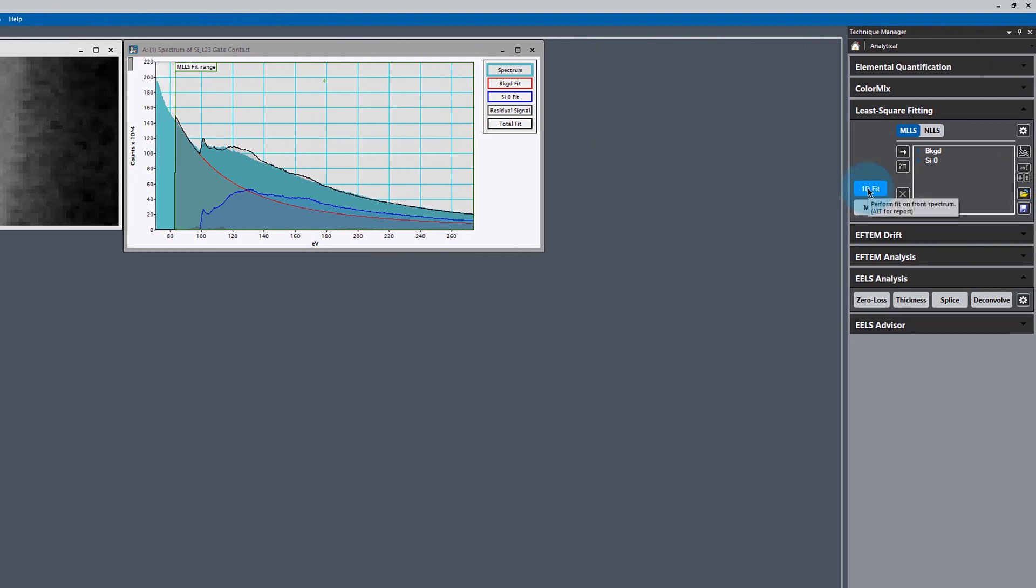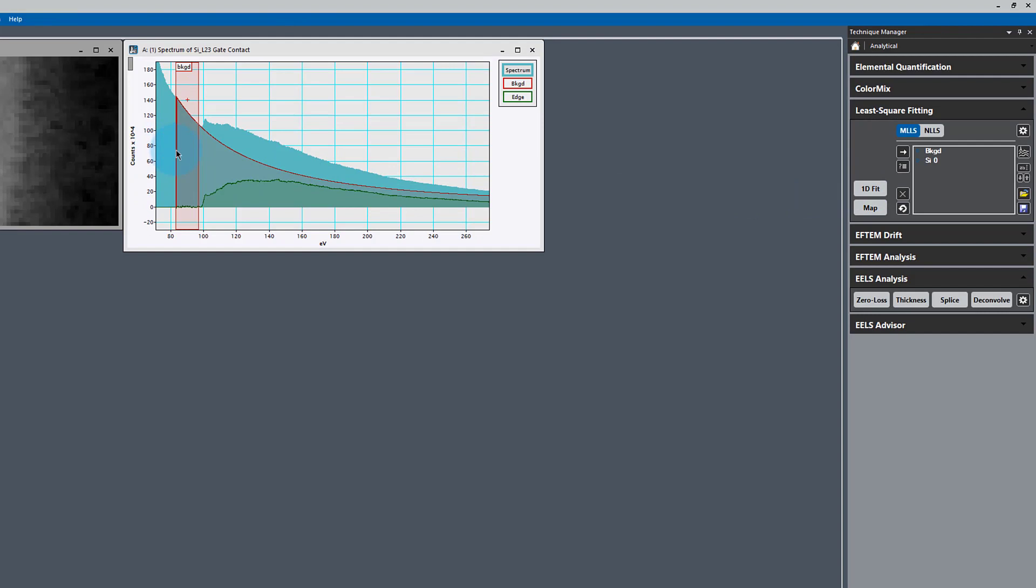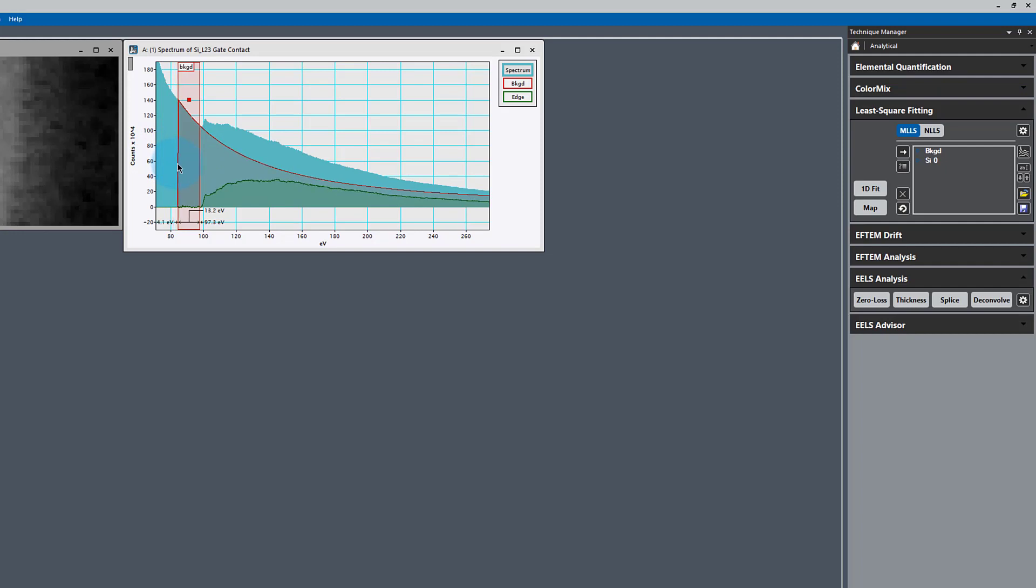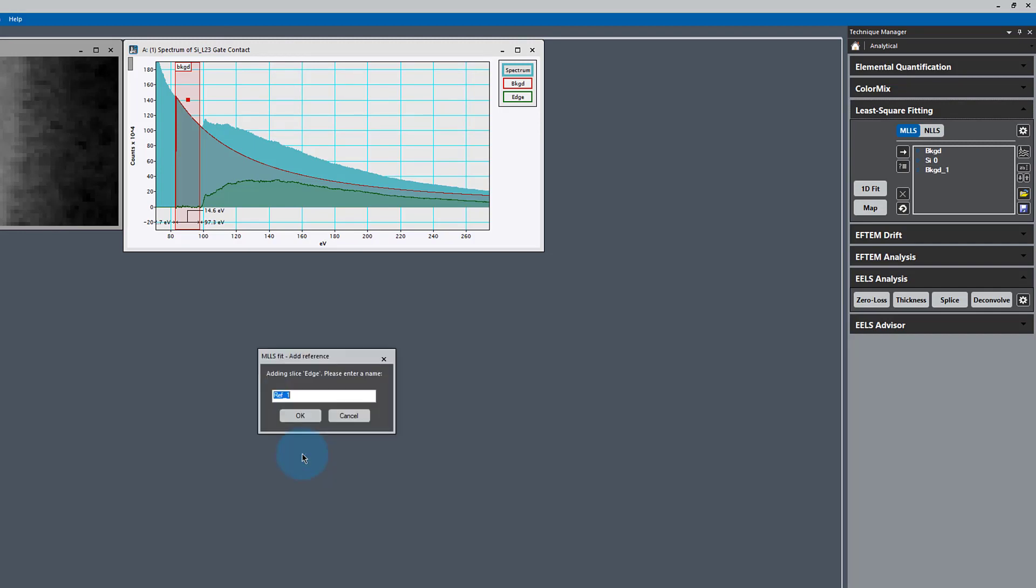I'm going to turn off the 1D fit for a moment and just look at my background. I can move that background window around if I want to. Now I'm going to add that to my fit as well. Since the backgrounds didn't match very well, I'm going to add the background and the edge as well. We're going to call this silicide.